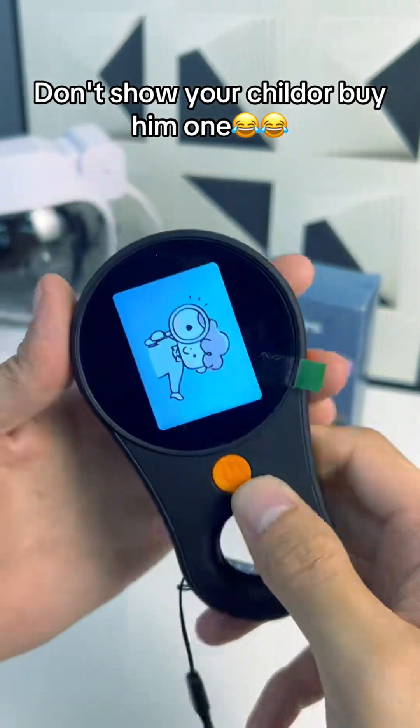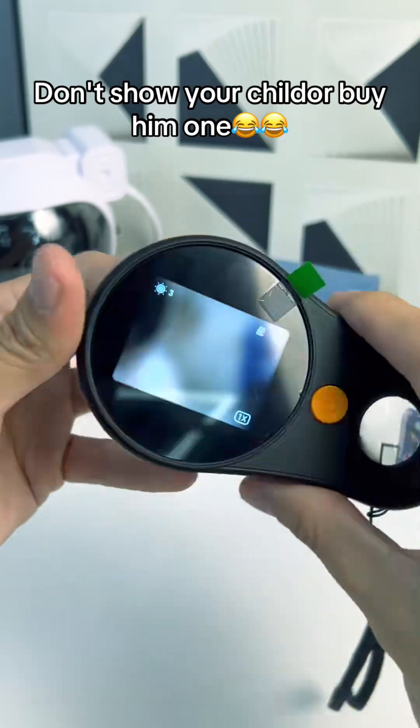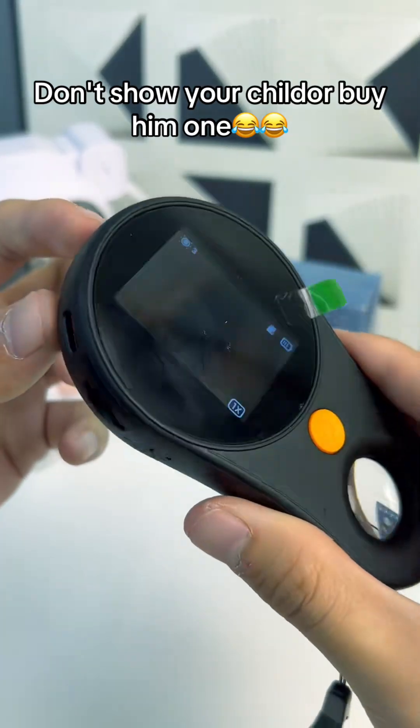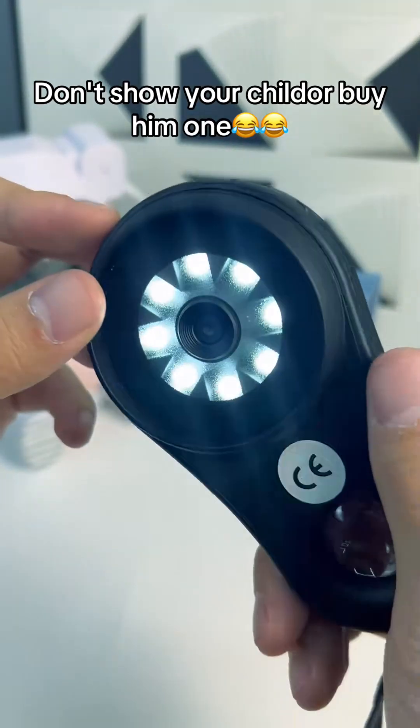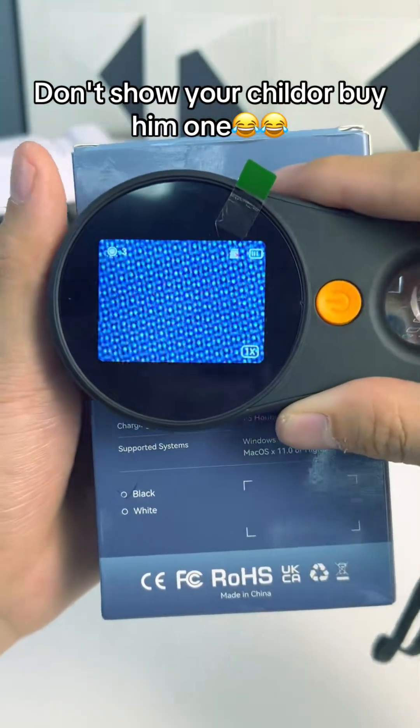It's rechargeable. Turn it on there — C adapter. It's got a lot on it. Look at those LEDs and look at the fine print on this box.